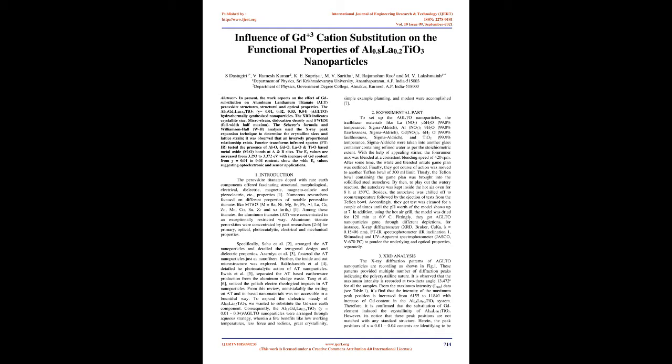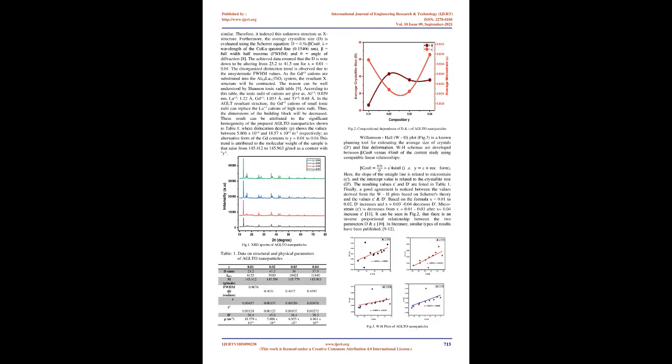To expand the dielectric study of Al0.8La0.2TiO3, we wanted to substitute the Gd rare earth component. Consequently, the Al0.8GdyLa0.2TiO3, y equals 0.01 to 0.04, AGLTO nanoparticles were prepared through the aqueous strategy, wherein a few benefits like low working temperatures, less power, less time consumption, good crystallinity, simple sample preparation, and low cost were achieved.